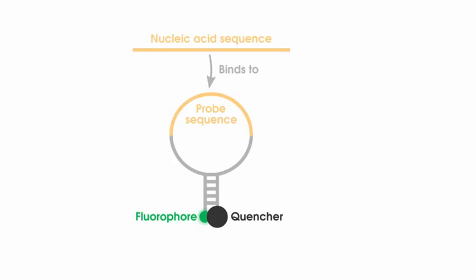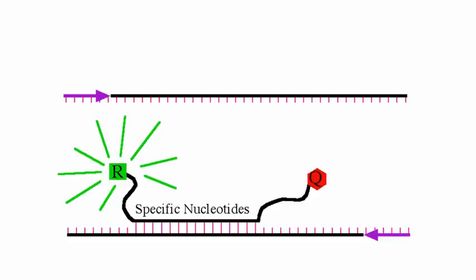So you have an instrument, and the instrument needs to be told what type of methodology you're using, so it knows whether to be measuring the fluorescence at the annealing step, for example, or to be measuring the fluorescence at the end of the extension step, because of the differing methodologies for each one.